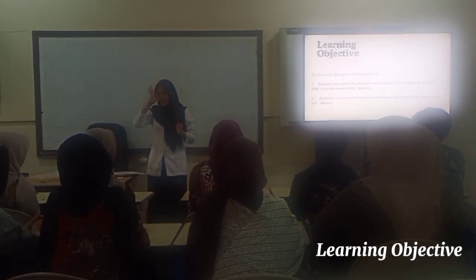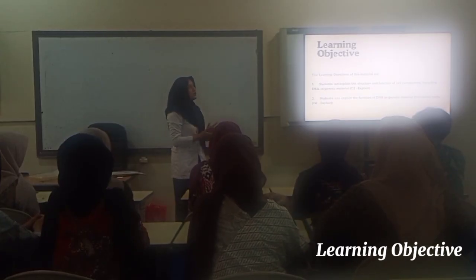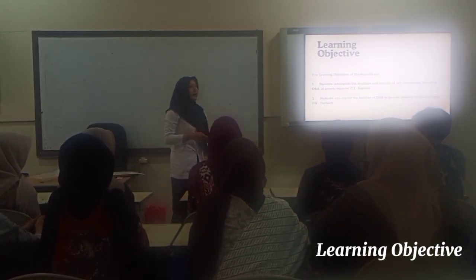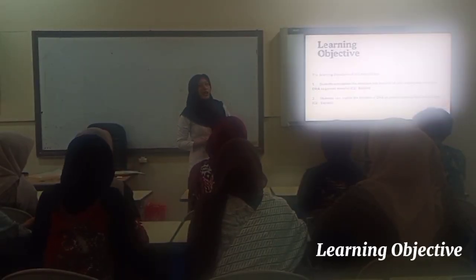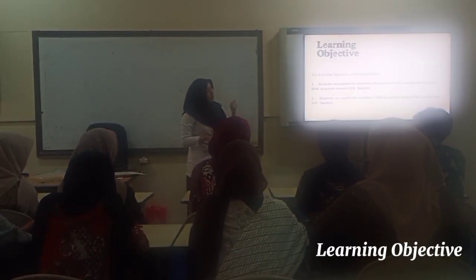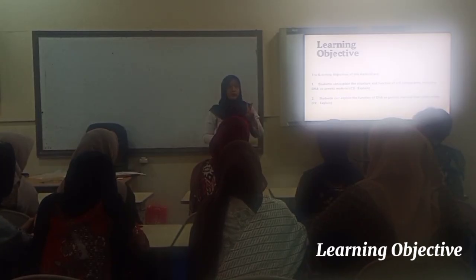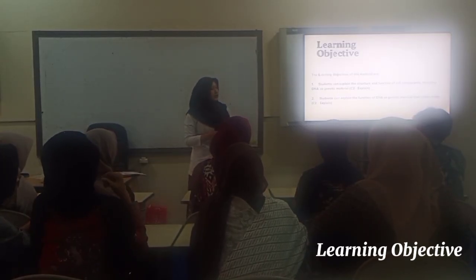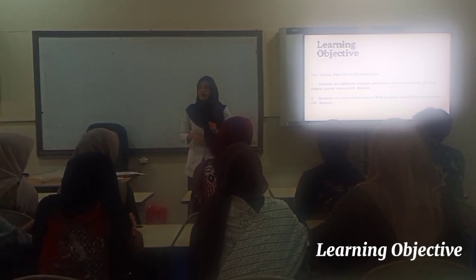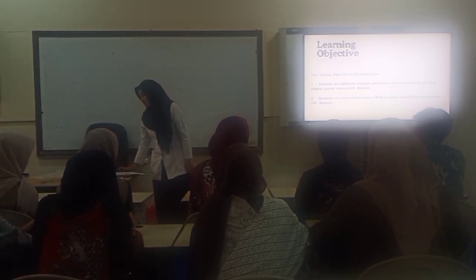Okay, the learning objective in genetics, the role of DNA. One, students can explain the structure and the function of cell components, including DNA as genetic material. Two, students can explain the function of DNA as the genetic material carrier in this material.